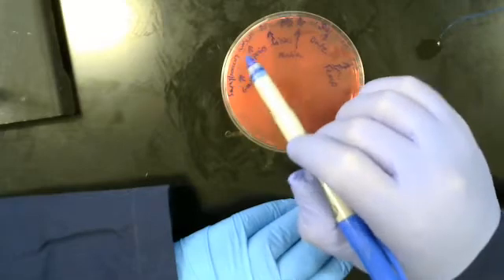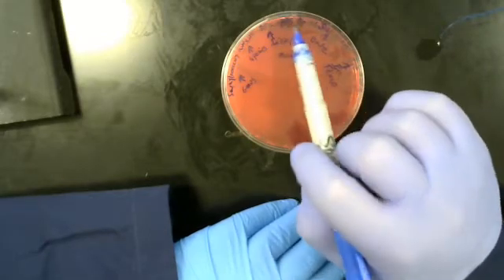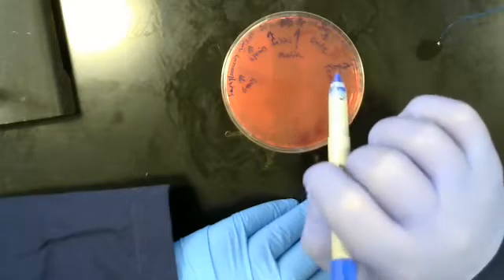...but by the end of the semester, the only labeling you should have is your genus, species, initial, media type, the date, incubation temperature.